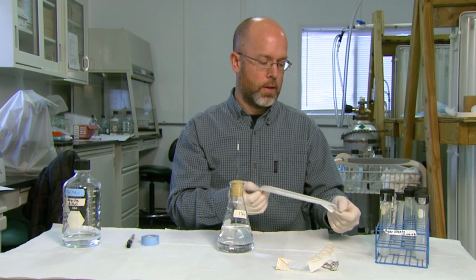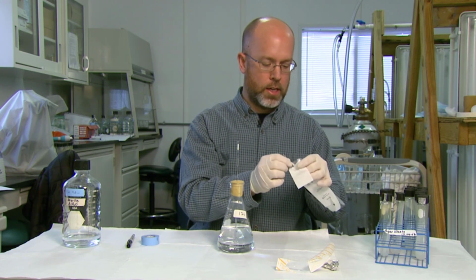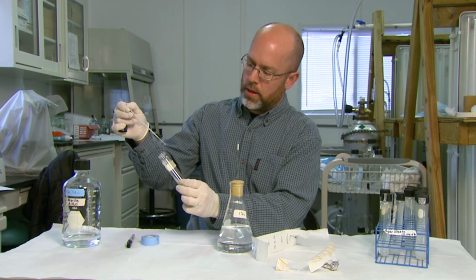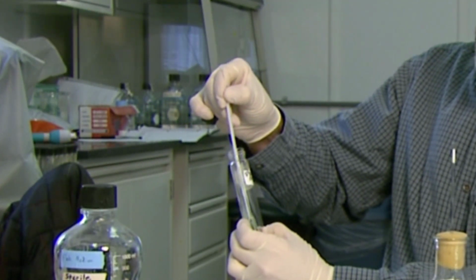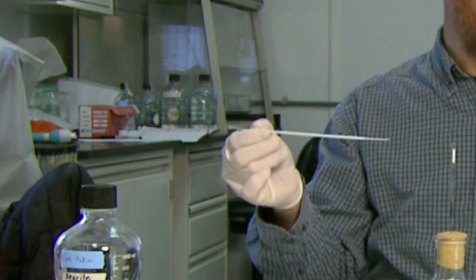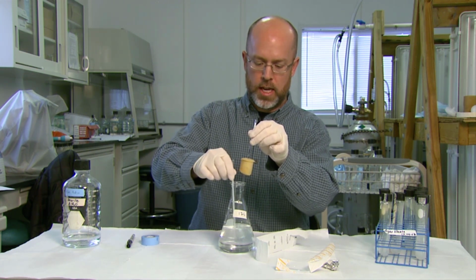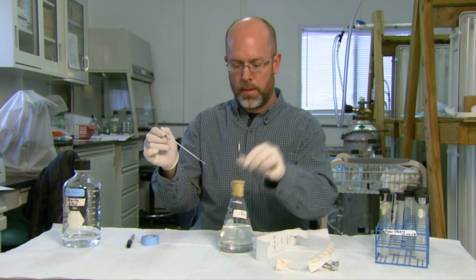Since I'm going to use the big looped end, I want to open it from the small loop end. Again, not touching the loop to anything. Same as before, in the pinky, to get the inoculum out of the tube. You can see in this case I'm going to get quite a bit larger inoculum. Again, pull the stopper out and just shake it back and forth until you see those algae cells come off of that loop, and put the stopper back.